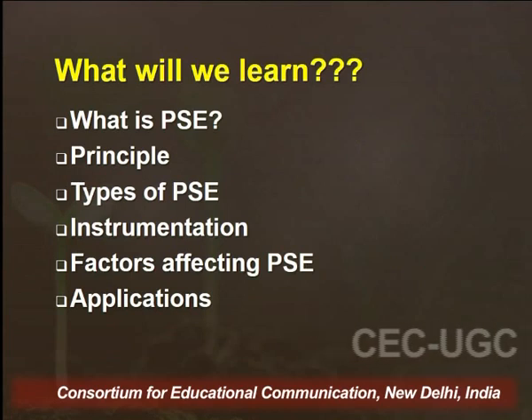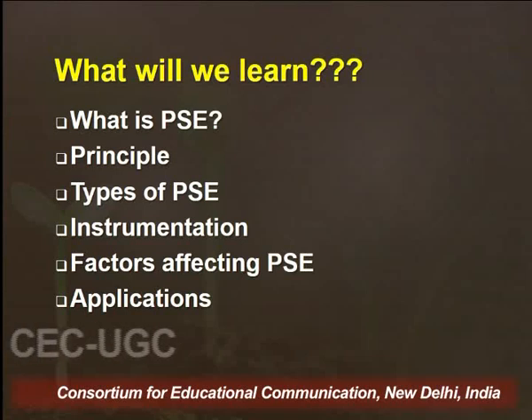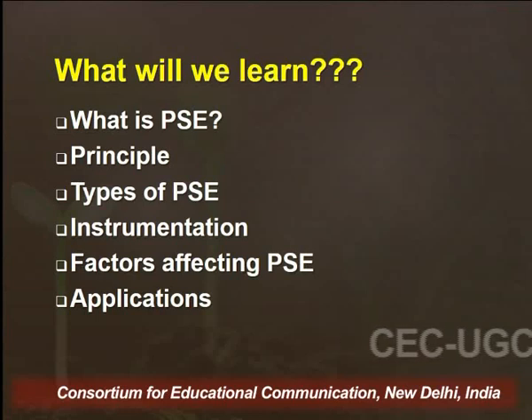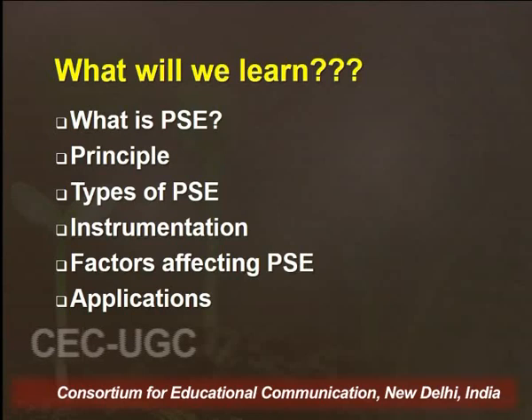Now I will be discussing this technique on the same lines on which I discussed the previous techniques. That is, first I will explain what the pressurized solvent extraction technique is and on what principle it is based, followed by the types or modes of pressurized solvent extraction, what kind of instrumentation is involved, what factors affect the overall efficiency of this technique, and in the end I will be discussing the applications of pressurized solvent extraction.